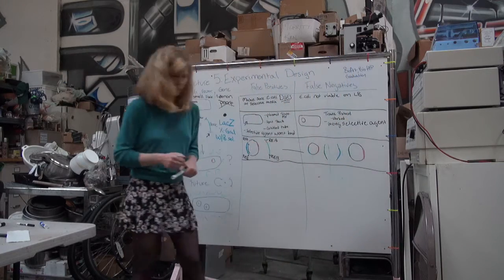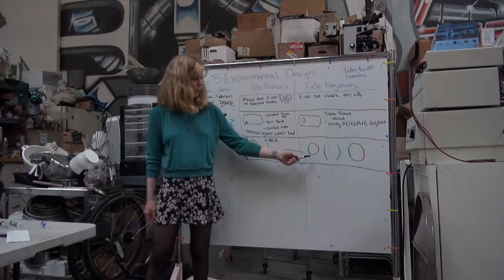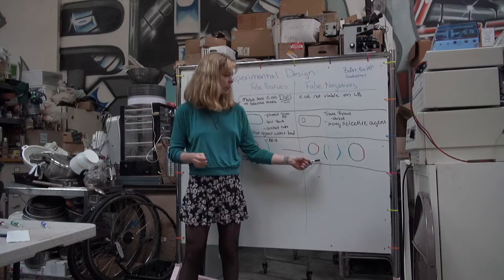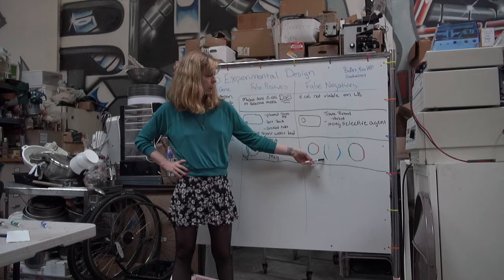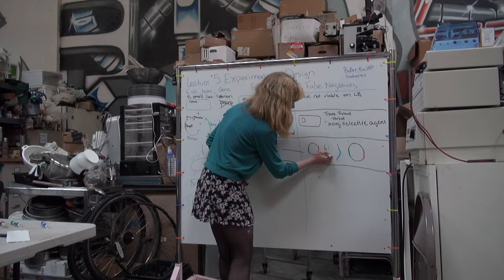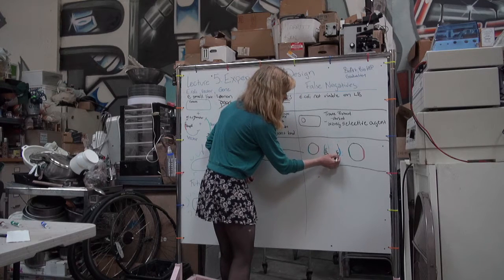All right, so what you're seeing here is plasmid uncut. This is our gene of interest. I'm sorry, I switched sides. I didn't realize actually it's not helpful. There, gene of interest. LacZ.